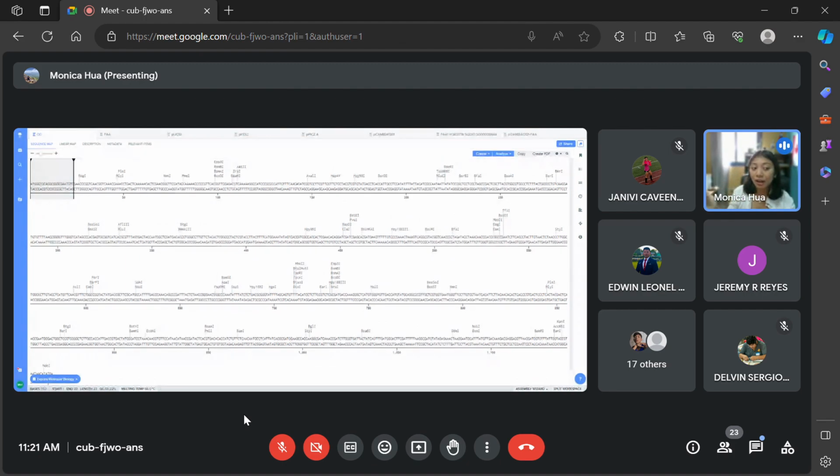So you don't want to have that long a strand of primer. But the primer cannot be too small either, because the smaller it is, the less specific it is. When you do a PCR with a very short primer of maybe 5 or 10 base pairs, it's going to stick onto random other sequences on the plant genome, because the likelihood of having those small little sequences is higher than having 20 base pairs that are the same. So that's why 20 is kind of like the lucky number. Sometimes we can't always have 20, because of other parameters, which I will show you right now.